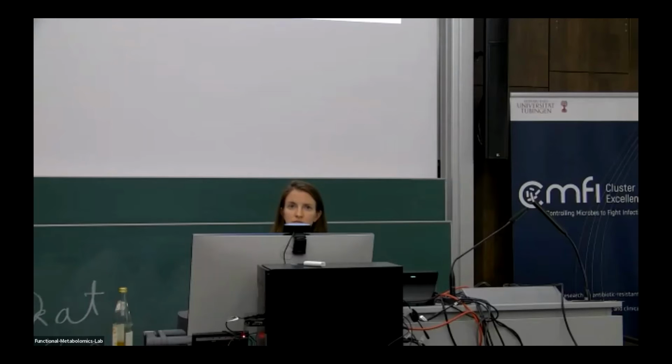And I think the consequence of that might be that MS2LDA is really nice for inspecting the data, visualizing the data with all the networks, because motifs might correspond to really large patterns. Or like, I mean, we show a lot of examples. And I think the CSI patterns are often smaller functional groups and stuff, which are well defined in spectral libraries, which we can learn from spectral libraries.